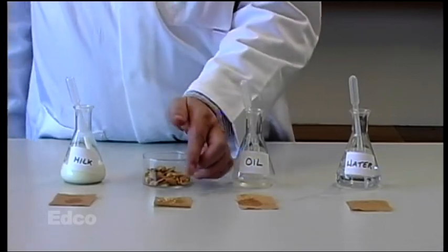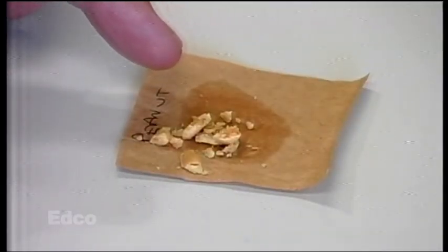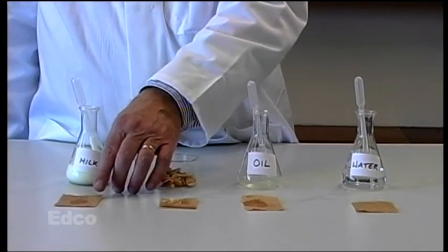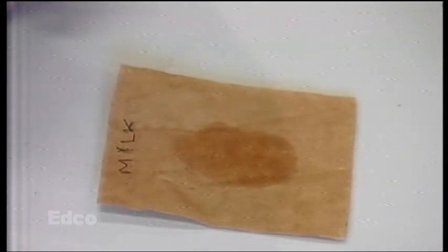In the case of the peanut, again a stain is present — a permanent stain — it hasn't dried out, showing fat is present. And in the case of the milk, a stain is present showing that there is fat. This milk in fact was full fat milk, which gives a very clear effect.